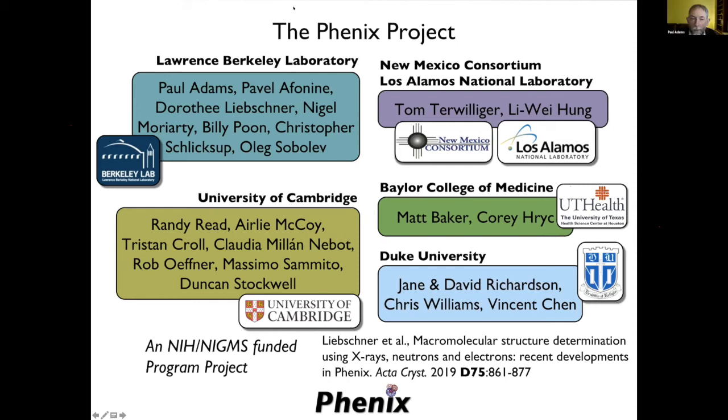Yeah, and it's also good. TLS relies on having the atoms kind of in the right place. So you want to make sure the model is reasonably correct before trying to do that.